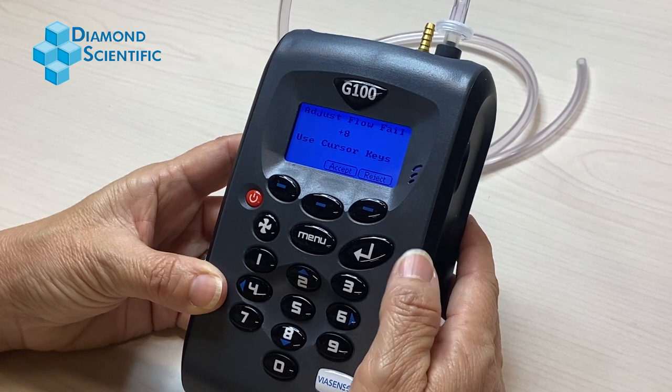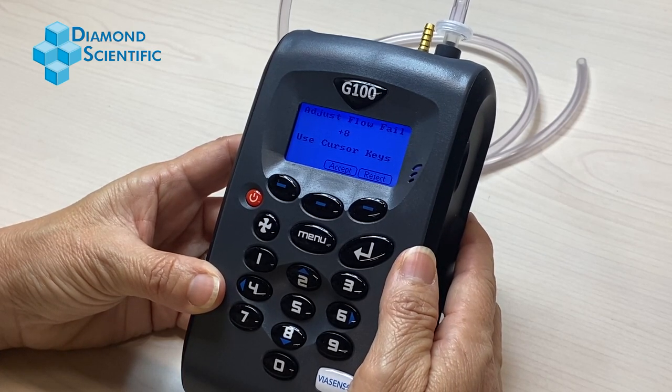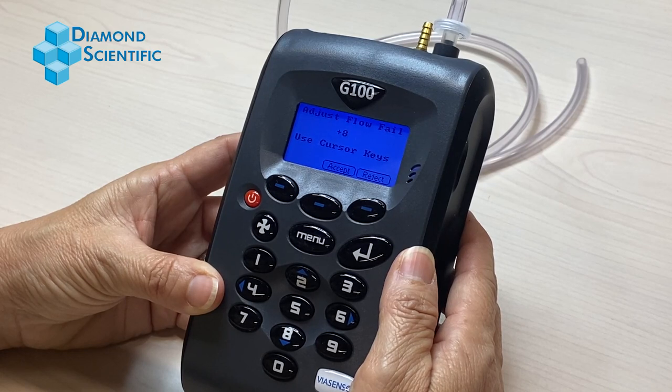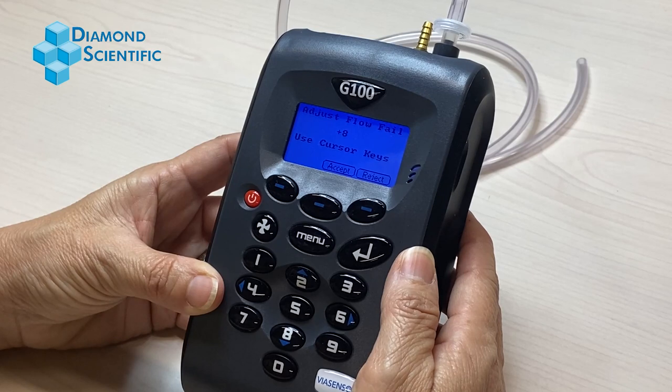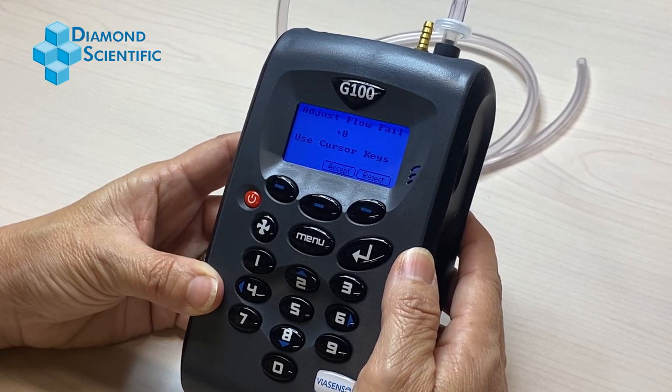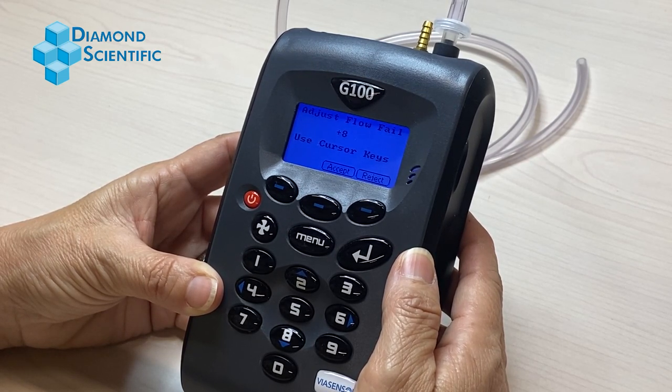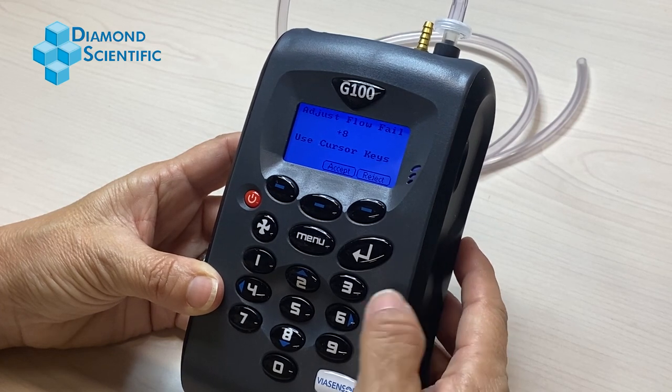This will adjust how sensitive the pump is to failure. The lower the number, the easier it will fail. You want this number as low as it can be without failing under normal conditions. The reason for this is if you start to pull moisture into your tubing, you want the pump to fail and stop pumping so that it doesn't ruin the analyzer.